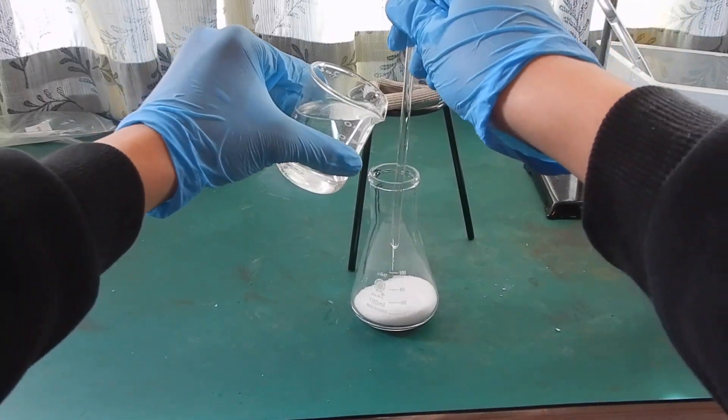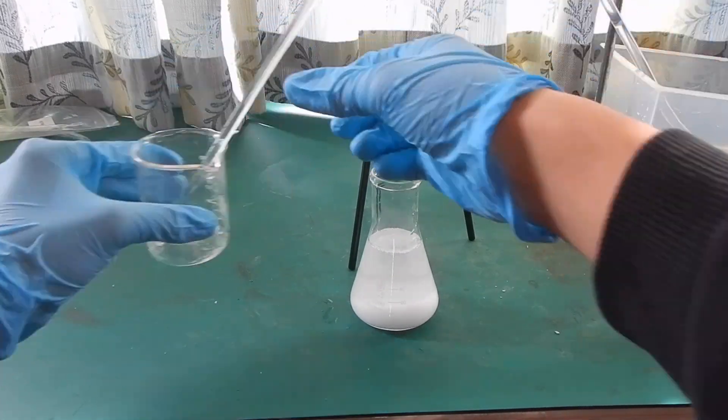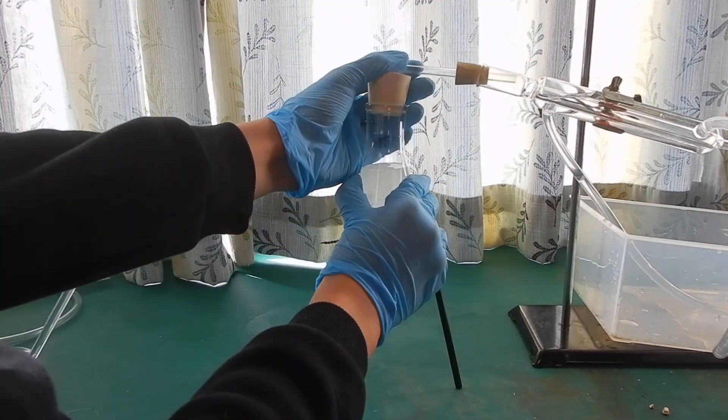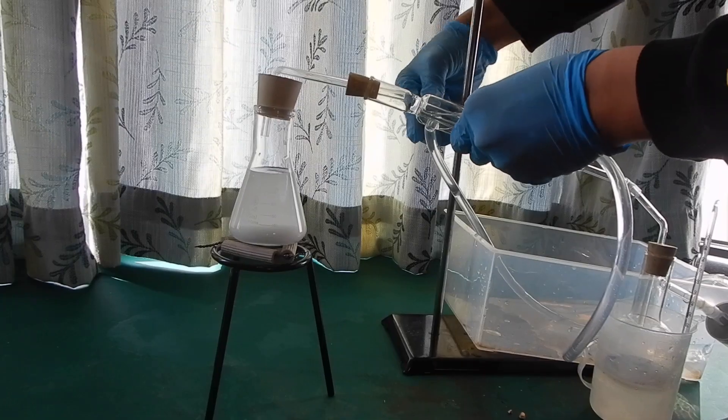Now we are ready to start the reaction. Pour the sodium bisulfate solution into the conical flask with the sodium chloride inside, and seal the apparatus tightly. We are now ready to begin our heating process.